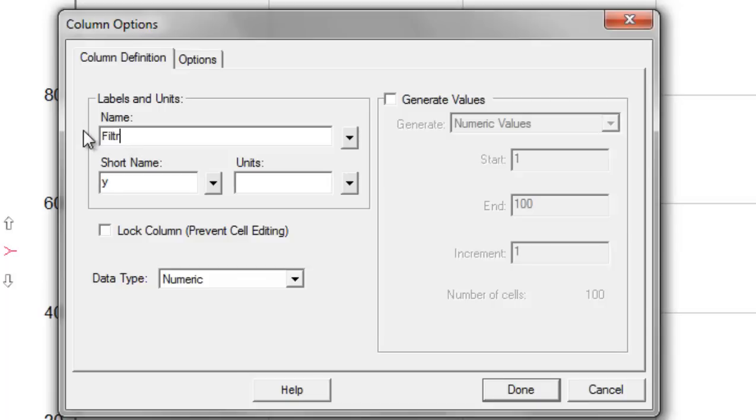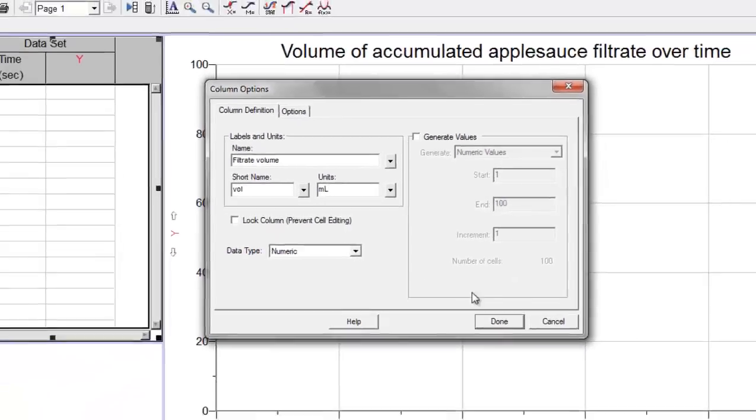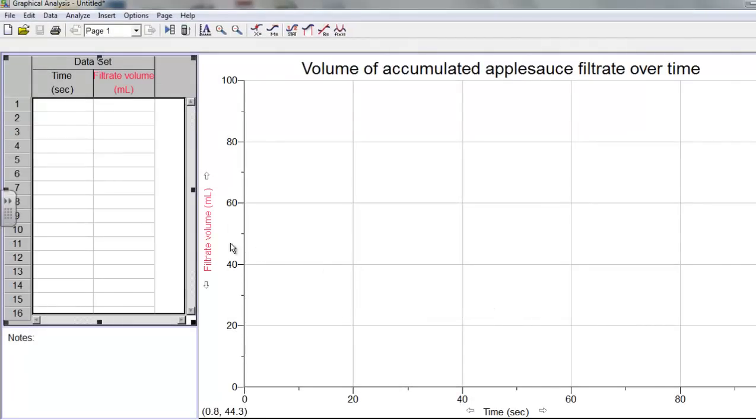I'm going to double click on y, get my Column Options window for y. This is going to be filtrate volume. My short name would just be volume. What were the units on the graduated cylinders that you used? That's lowercase m and then capital L, milliliters. I'm going to hit Done and look what happens - it populates up here and it populates on the graph correspondingly.